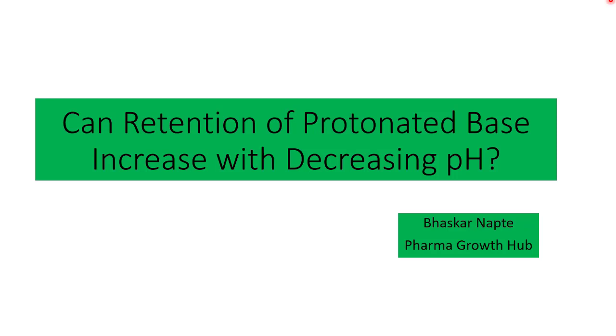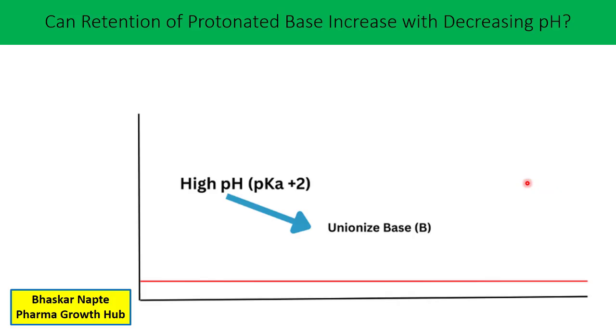And today's topic for discussion is, can retention of protonated base increase with decreasing pH? Generally, the retention time of a protonated base at a lower pH is always lower. However, is there a possibility that the retention of protonated base actually gets increased at the lower pH? And that is something we are going to talk about today.